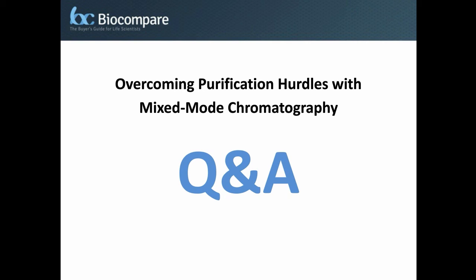So to start things off, the first question we have is, when would mixed mode chromatography be beneficial over traditional? Right. So there are actually two advantages that might make you choose it over traditional. One is that the separation mechanism is different than the type of chromatography that only employs one mode of adsorption-desorption. So you get different selectivities. So you would employ it when the traditional methods just aren't working well enough for you.